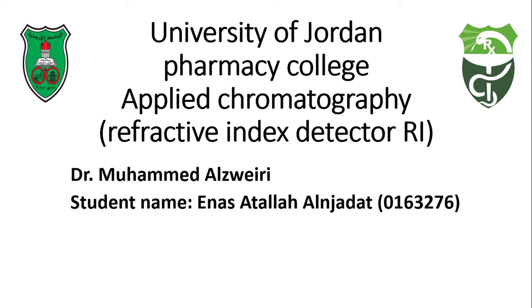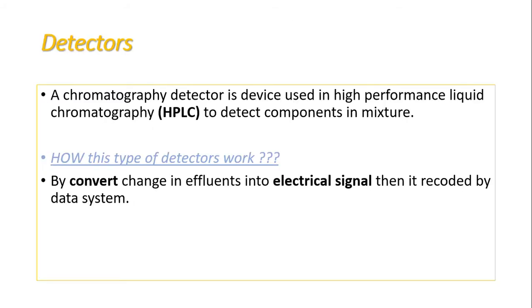I will be talking about the refractive index detector. The abbreviation of this type of detector is RI or RID. First of all, a detector in general, and in chromatography especially, is a device used in high performance liquid chromatography. So this means it's specific for HPLC.